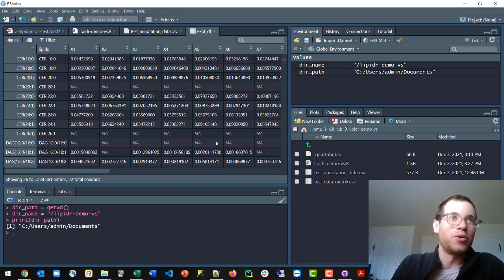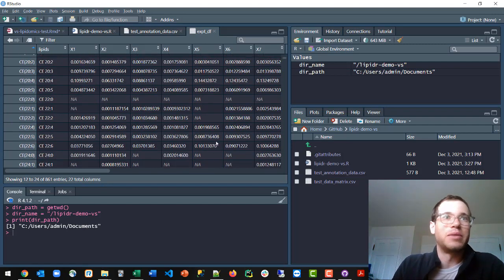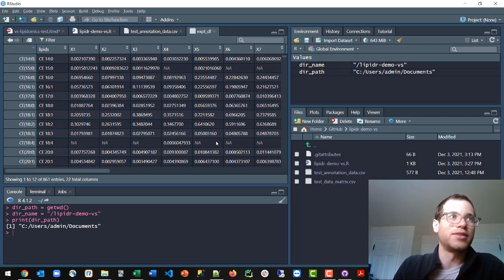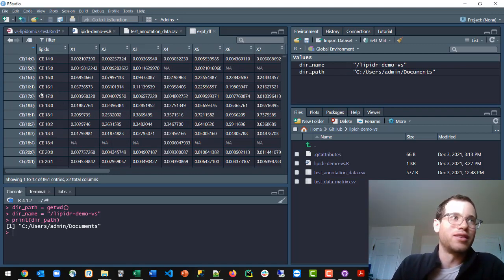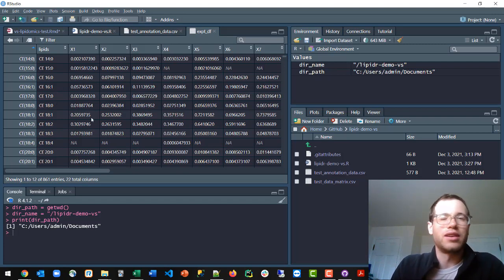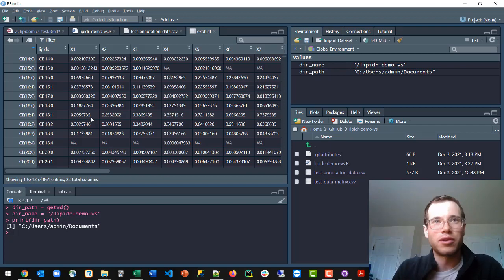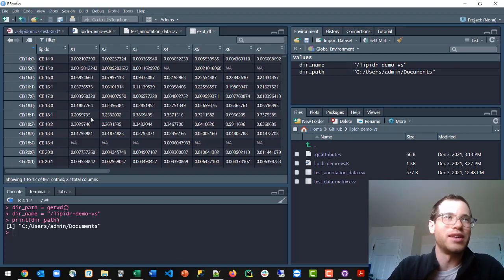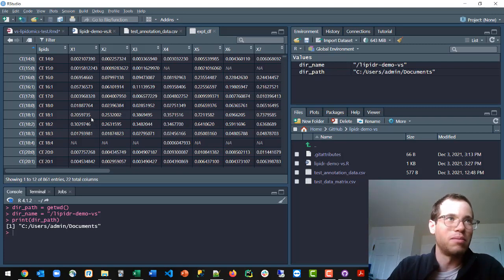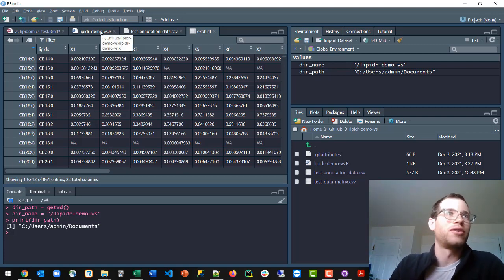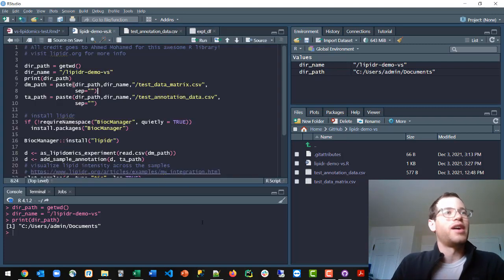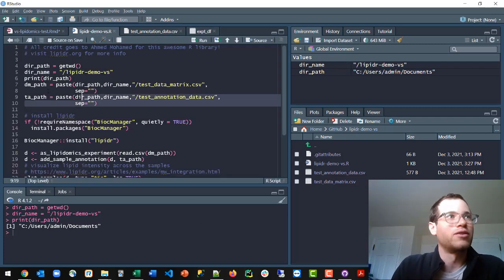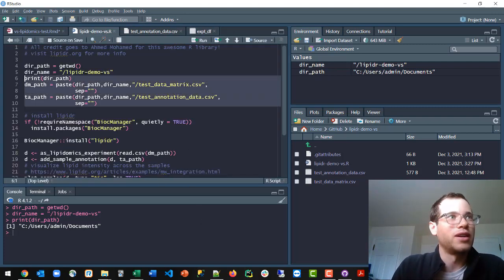Otherwise, it will error out, because a lot of the lipidomics analysis requires not just looking at these numbers, but knowing the species or the class of lipid, as well as, is it an even-numbered or odd-numbered? There's a bunch of other analysis going on behind the scenes here, so parsing out the type of lipid makes a very big difference. And so you will need to do that in order to get this to run correctly. But getting back to this, we've got our directory specified.